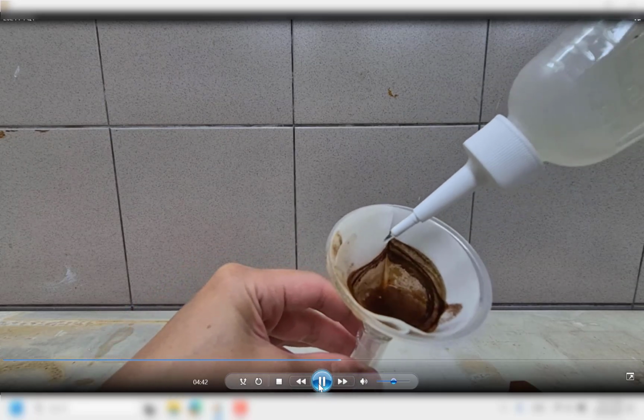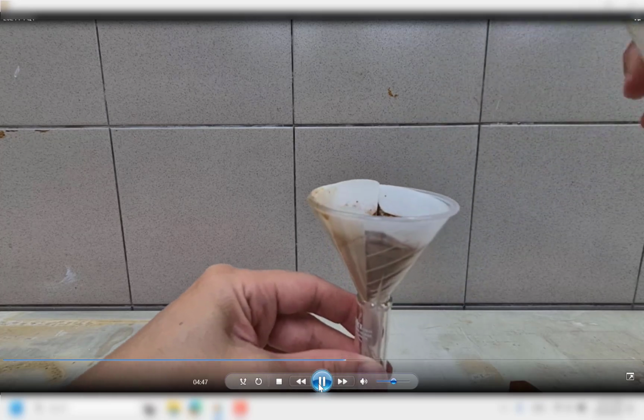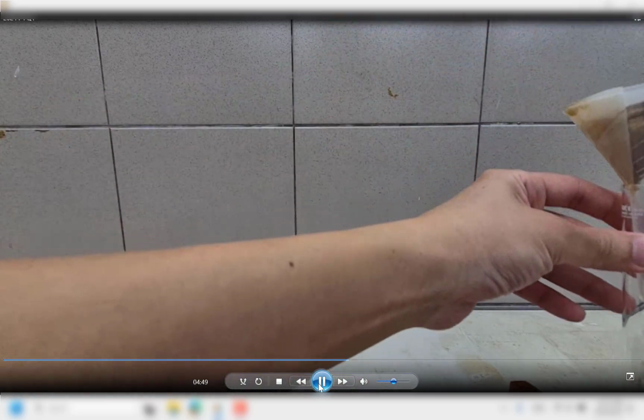Do take note of one thing: not all the brown PPT will dissolve completely. This is normal, because the brown PPT is actually a complex mixture. So do take note of that. We're not expecting you to dissolve them completely, and it's not mentioned anywhere that it should be dissolved completely.